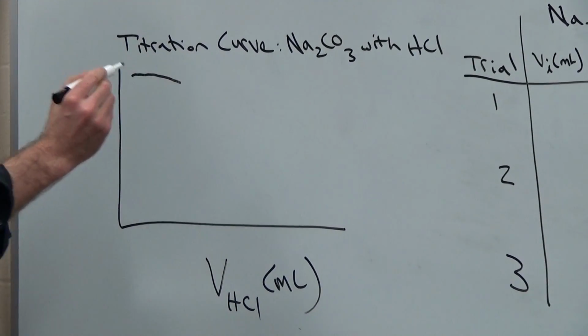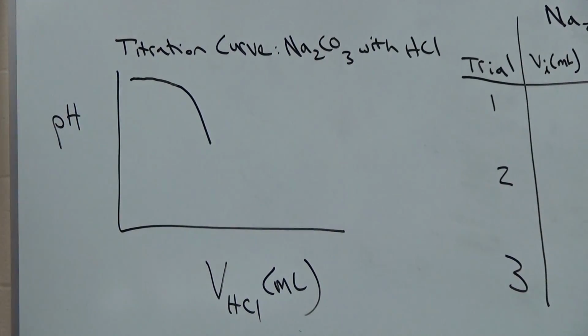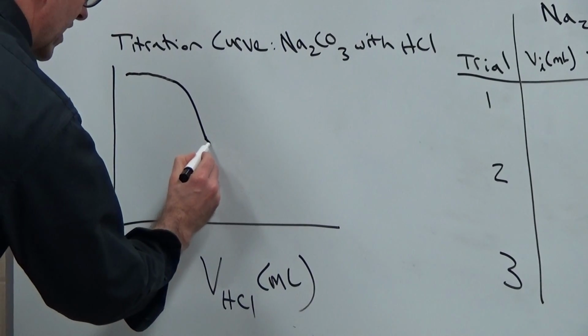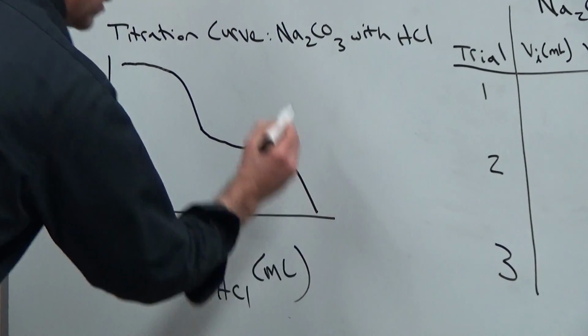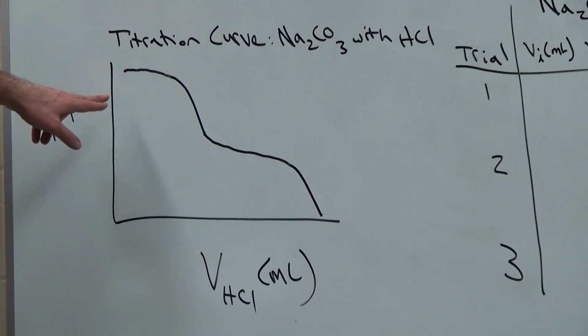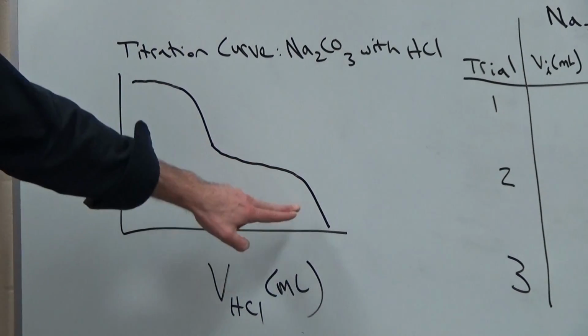And ideally those are the same. So when you get close to the endpoint, boom, the pH really drops. Then if there's another endpoint, you keep titrating, it kind of plateaus off, and when you get close to the second endpoint, it drops off precipitously again. So this is what a titration curve would look like with a weak dibasic compound with a strong acid.